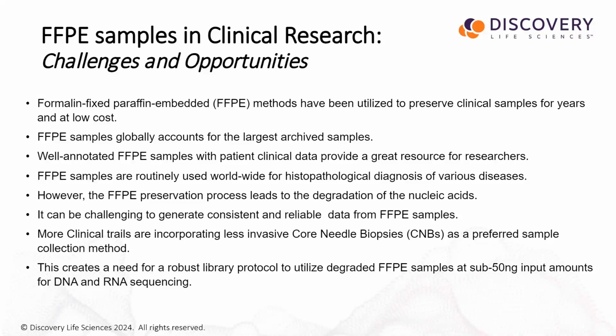As we move forward, what we are seeing is a shift in clinical trials as more invasive methodologies, such as resection, are being let go, and less invasive core-needle biopsies are a preferred sample collection method.